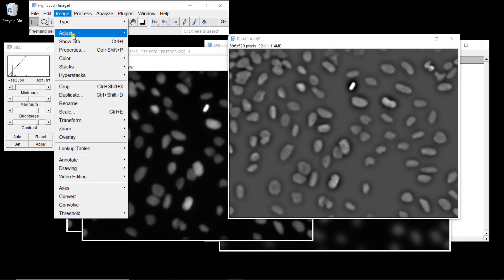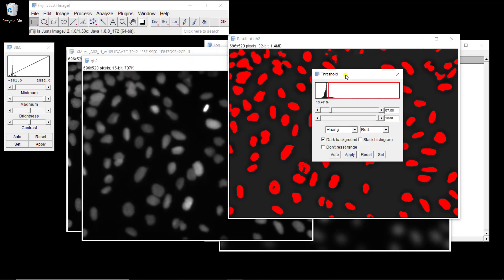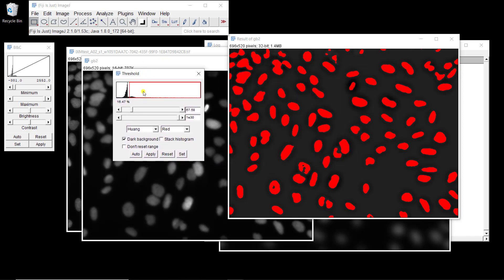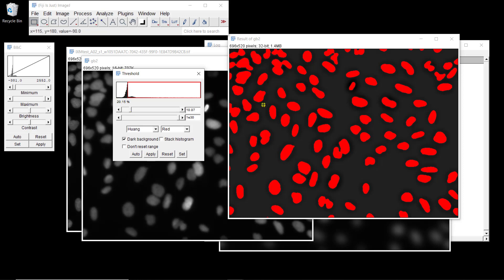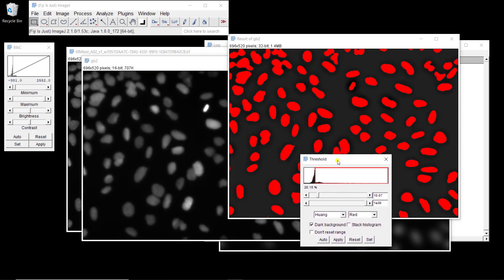If we use the threshold tool — Image > Adjust > Threshold — we have a huge peak. We know the peak corresponds to the background, so if we threshold right after the peak, we get a nice mask. The good thing is that you get all the nuclei, even the ones that have a low intensity. That's the advantage of using a scale-based approach.